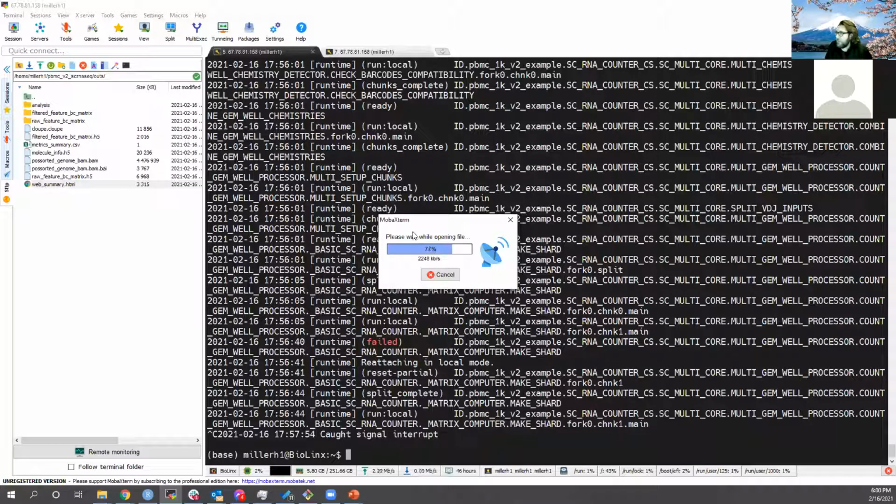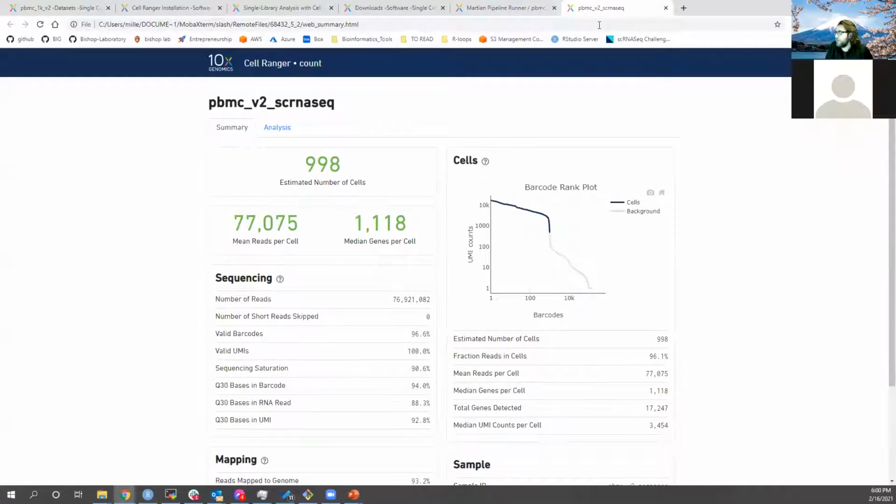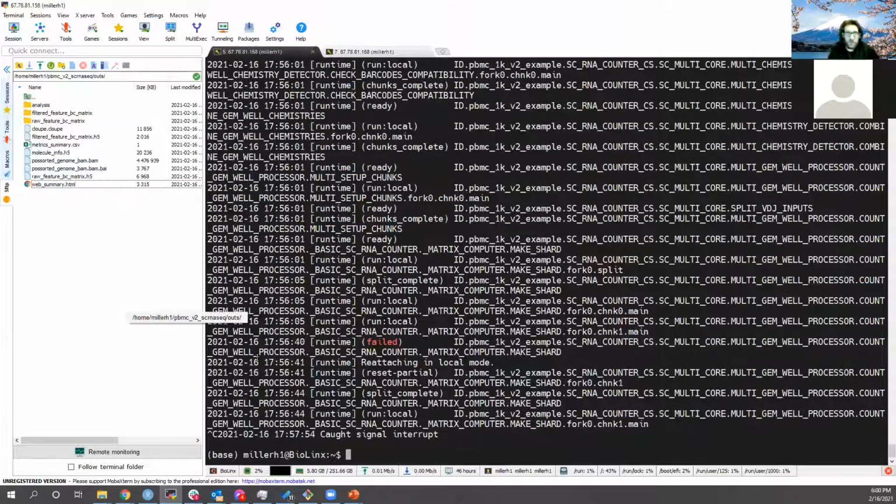And I guess before we jump into this, because this is going to start us on the path towards the quality control side of things, does anybody have any questions they want to ask about what I've shown here as far as running scRNA goes?